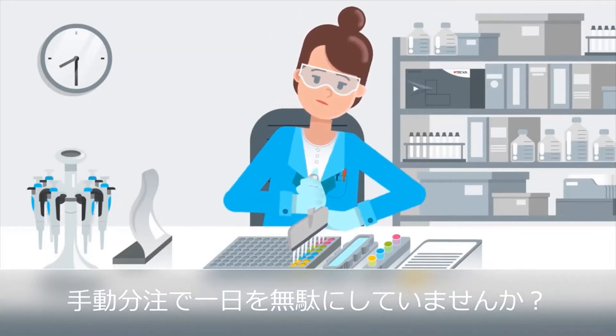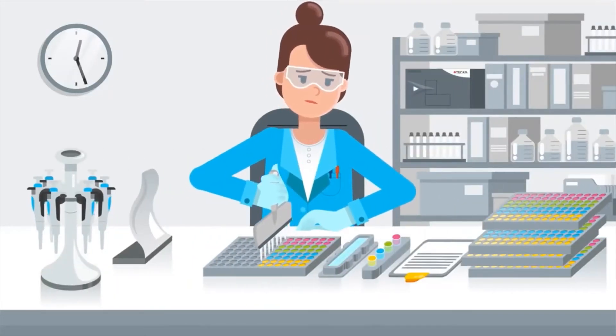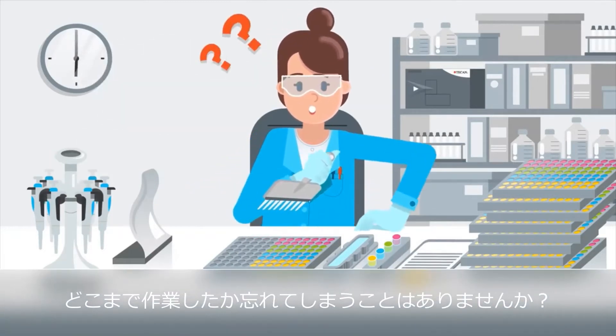Do you feel like you're wasting your days on manual pipetting? Have you ever lost track of your samples?